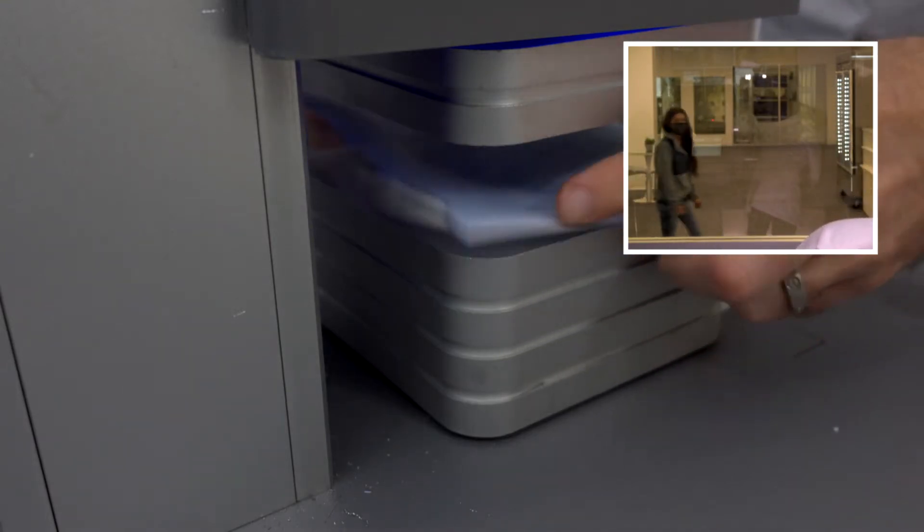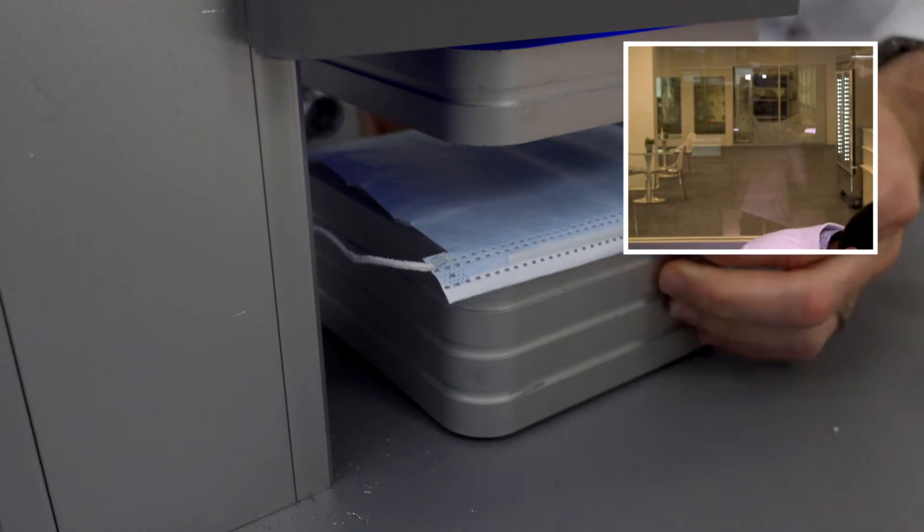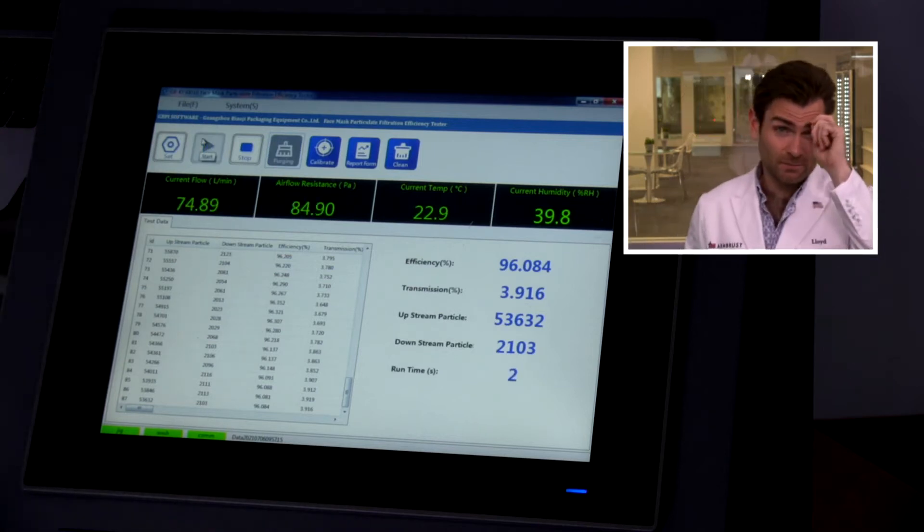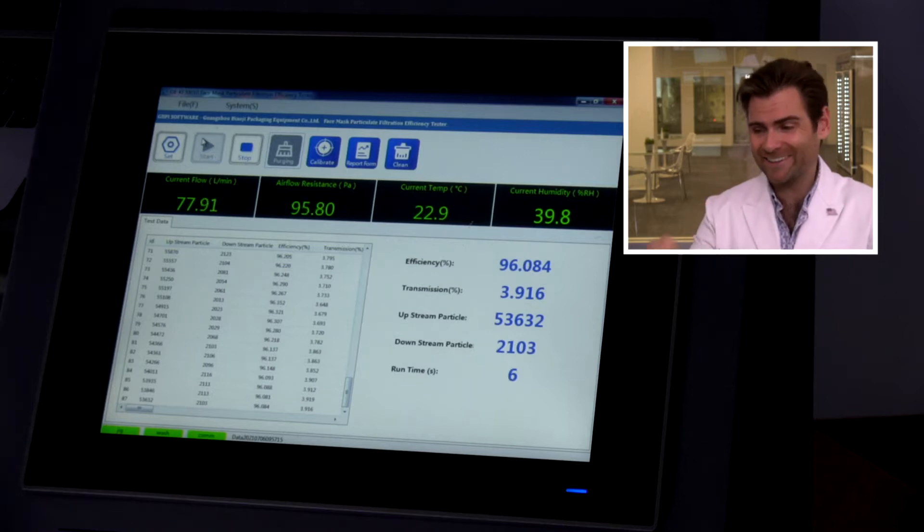This is a mask from a company called Vandalay. This is a PFE machine — particulate filtration efficiency machine. If you want to find out more about this machine, check out that link. Vandalay — wasn't that Art Vandalay from Seinfeld? He was an importer-exporter, fictional character, actually George Costanza himself. Apparently he is importing and exporting masks now.